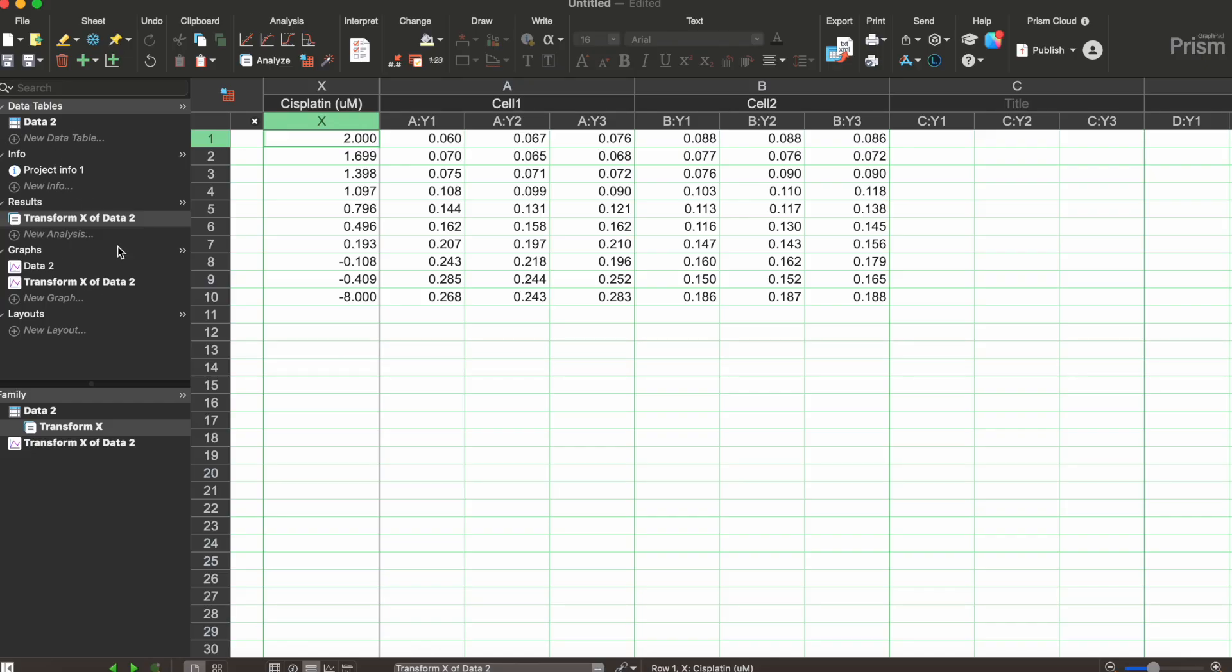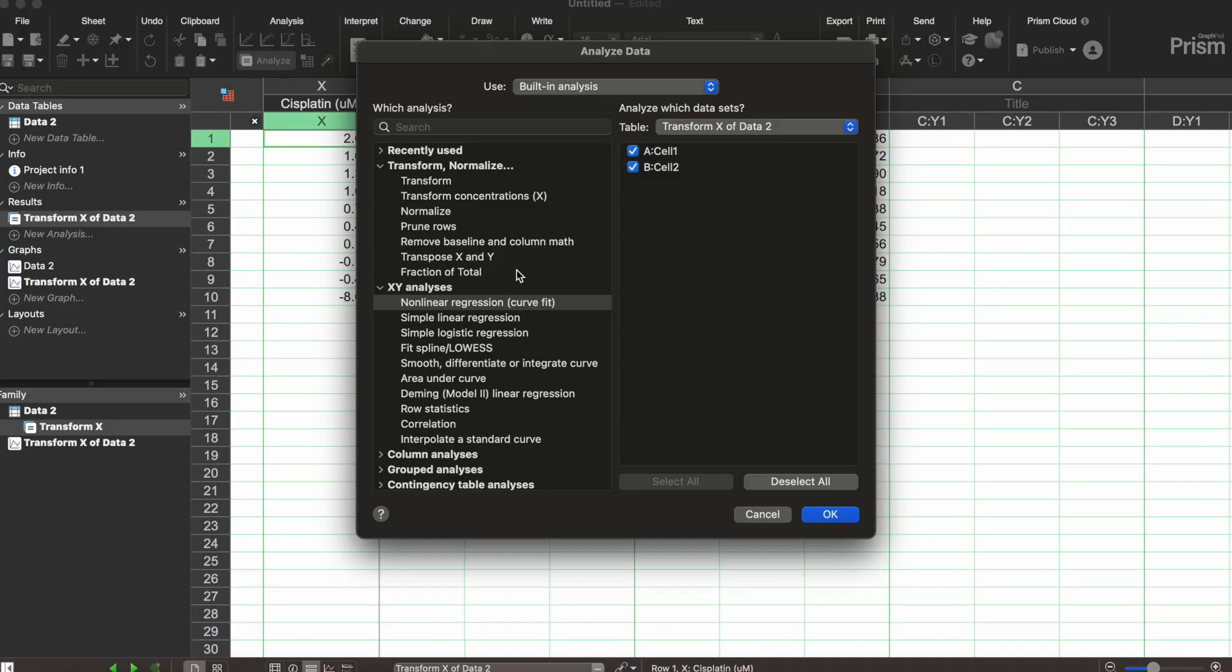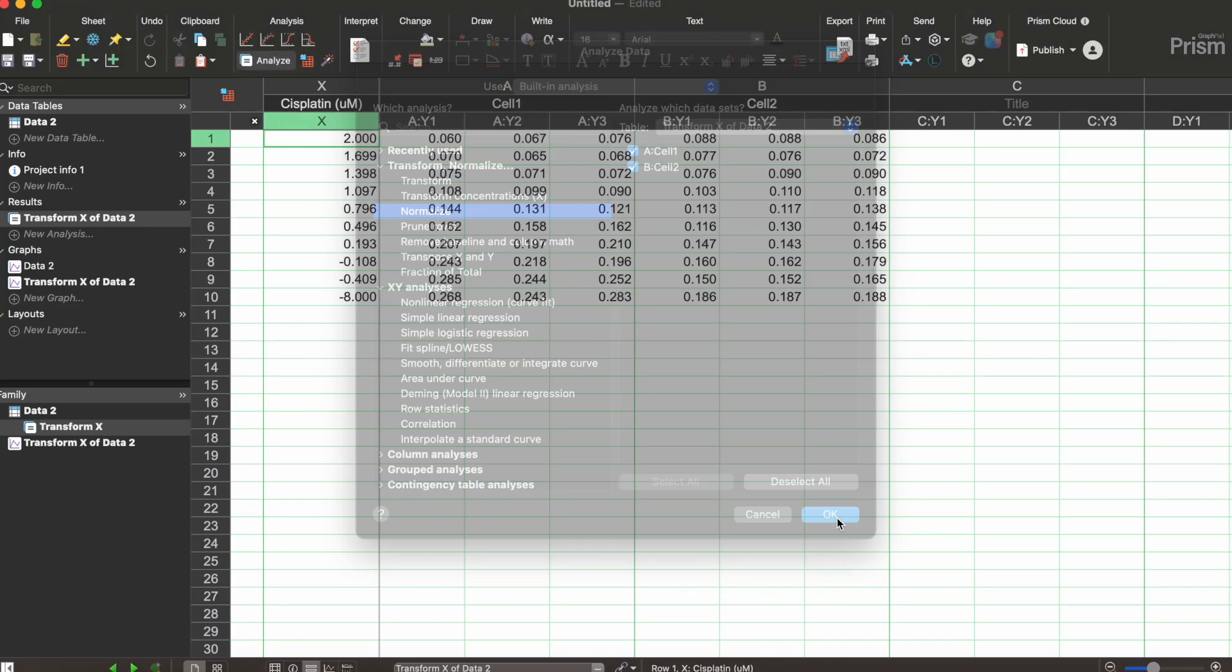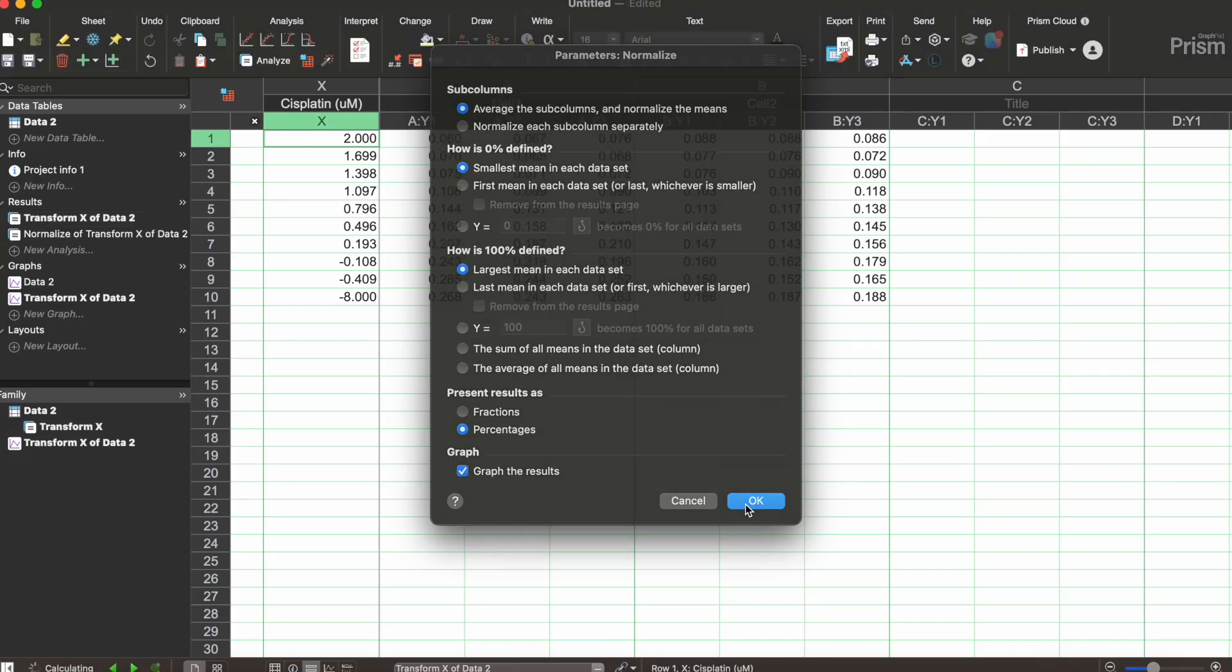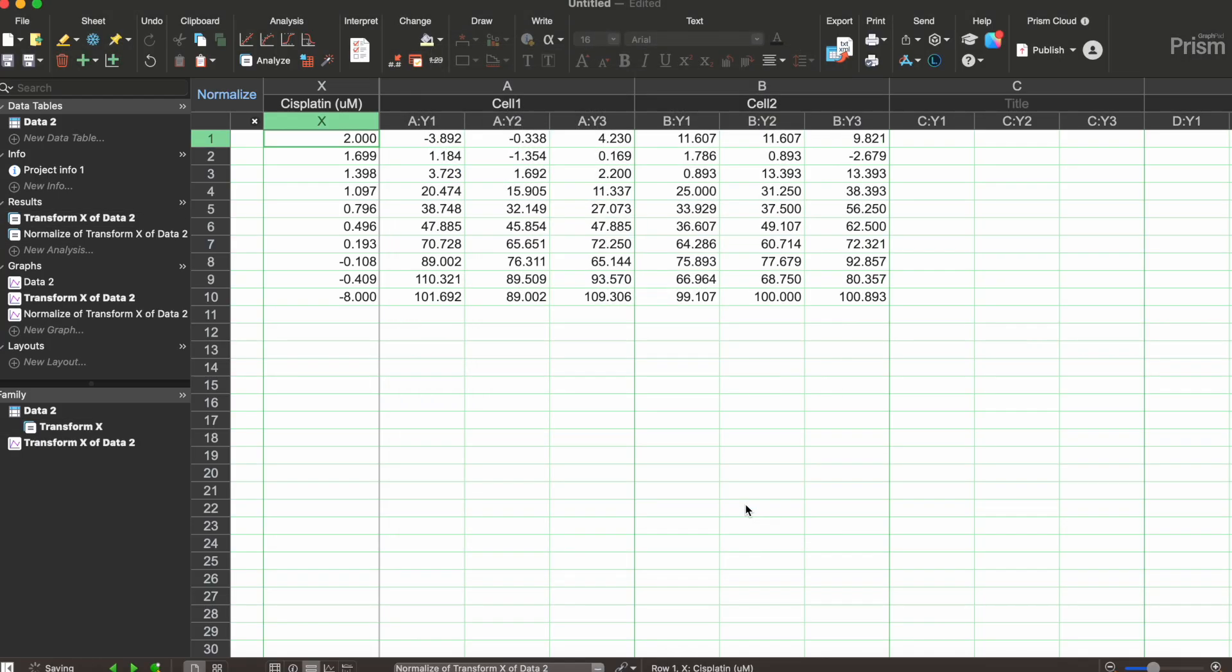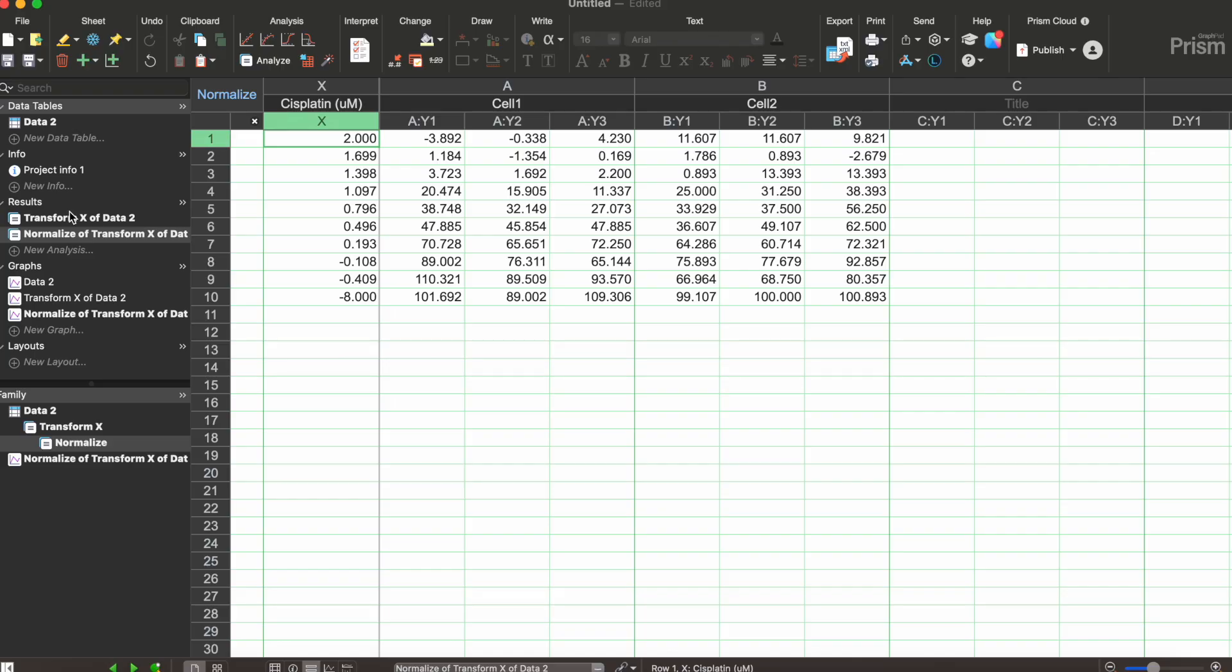So staying on this I'm gonna push analyze again and I'm gonna normalize the data. Push ok. Everything here is fine I'm gonna push ok and now the data is normalized and so I'm here on the results tab, the normalization of the transformed data.